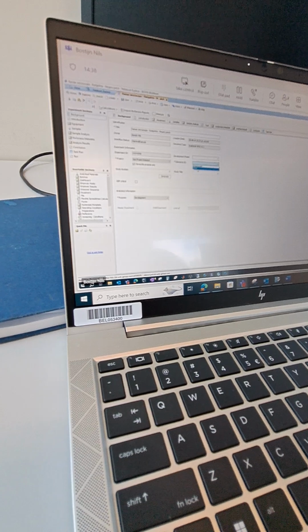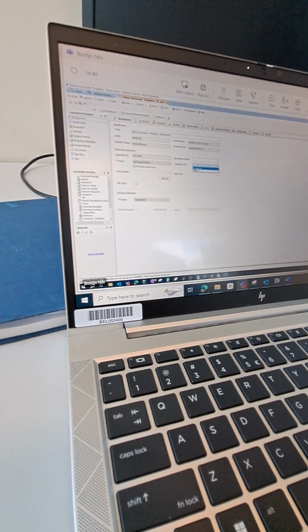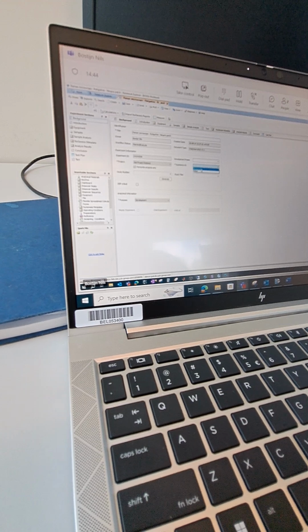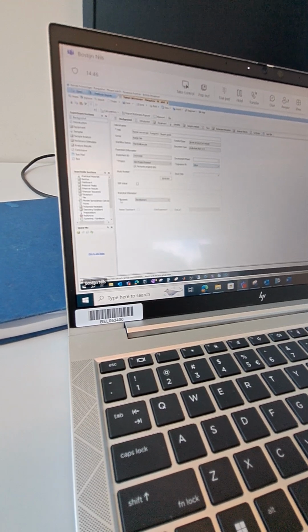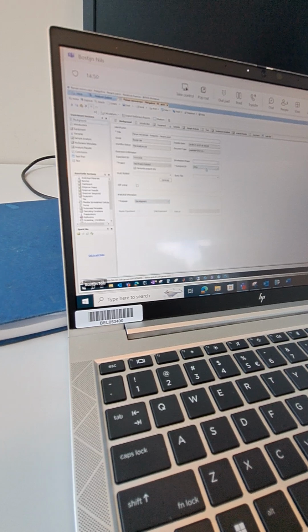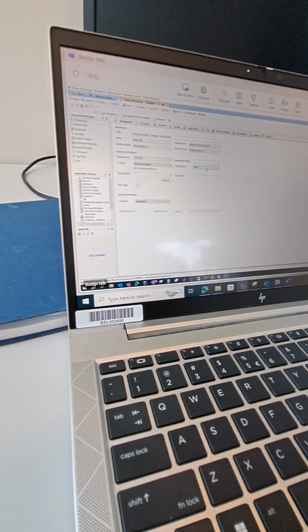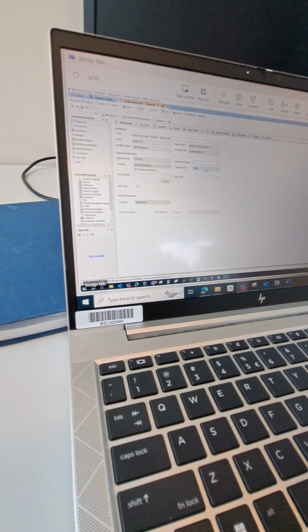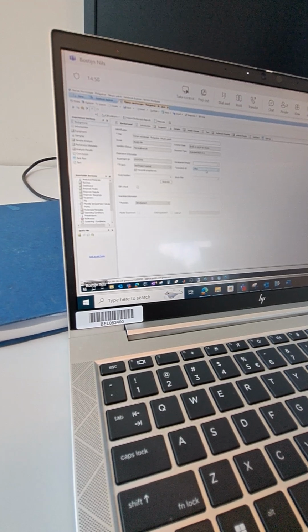For Substance ID you take other, because sometimes we use itraconazole as a tool compound, but here we will just say other. And then the purpose. Are you working with itraconazole? Sometimes we use it, yes. Do we have it available here in the lab? Yes, I guess so.